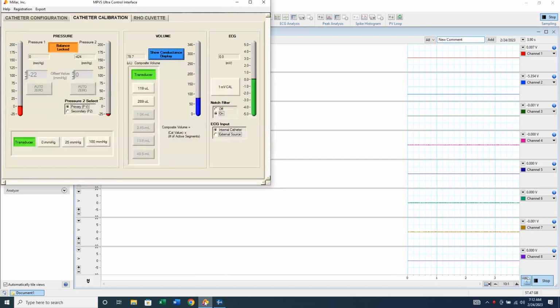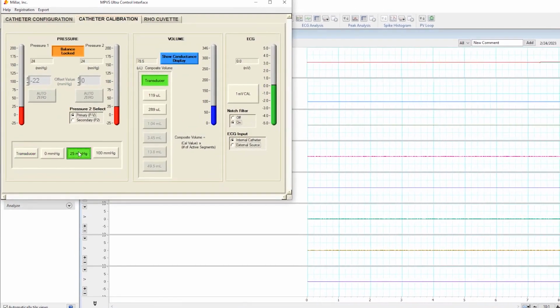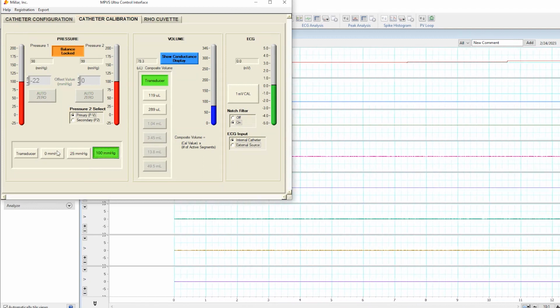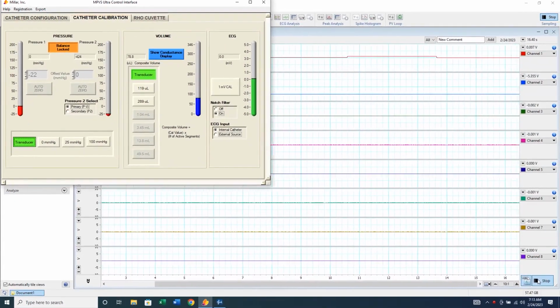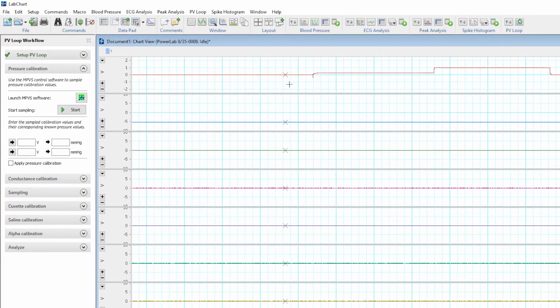Now move over to the control interface and click on the 25 mmHg button, and then after a couple of seconds, click on the 100 mmHg button. Then back to transducer. In LabChart, stop the recording. Select the data that reflects the 25 mmHg step, as shown, and click on the first arrow. The selected value will be placed here.